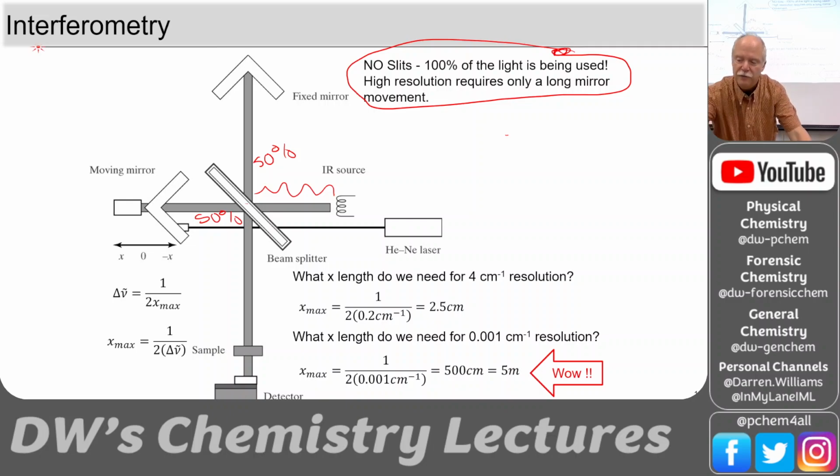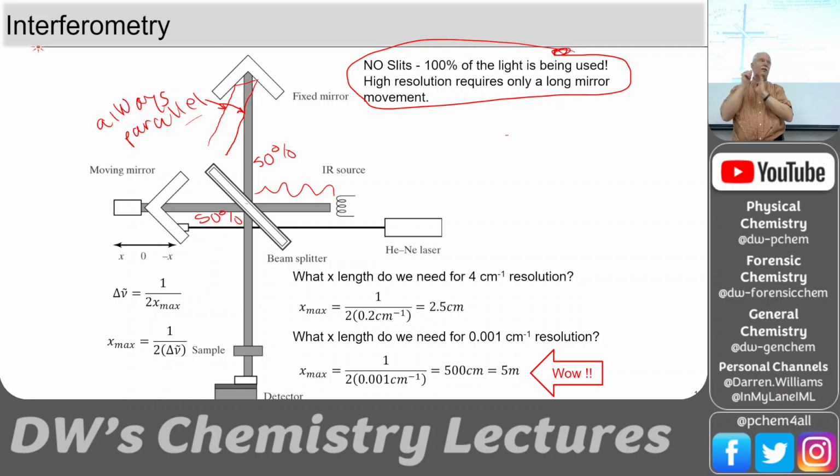So if it's misaligned at all, this is kind of cool. If let's say we were coming at this angle, it comes along here, it glances this one, bing, and it hits this one sharply and comes right back on a parallel path. So these two lines are always parallel. I can't draw the 3D version of this, but a cube will do the same thing. A corner cube where you have three mirrors all at right angles. You'll never get out of the corner of that cube. No matter what angle you're coming at, it always comes back parallel to that.